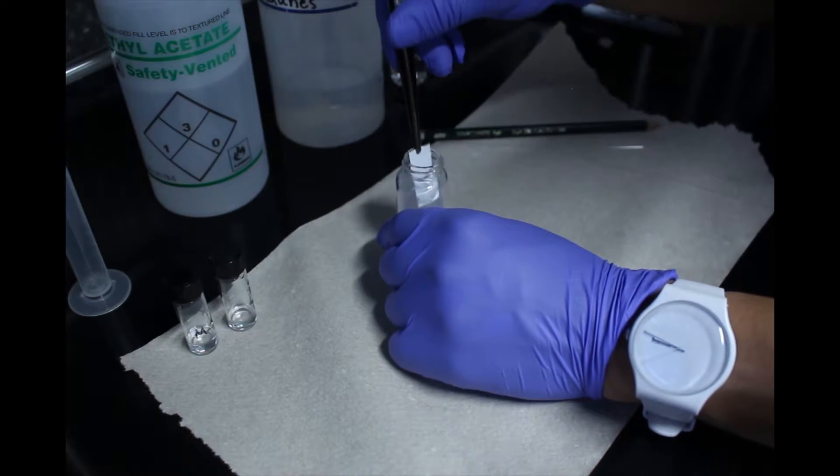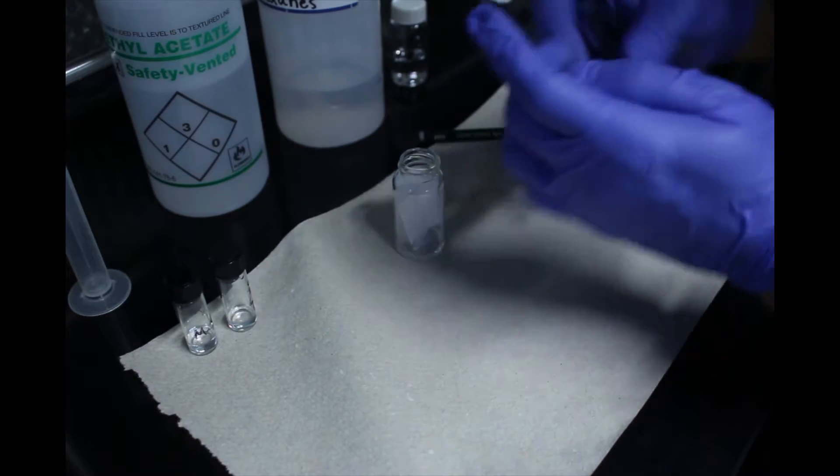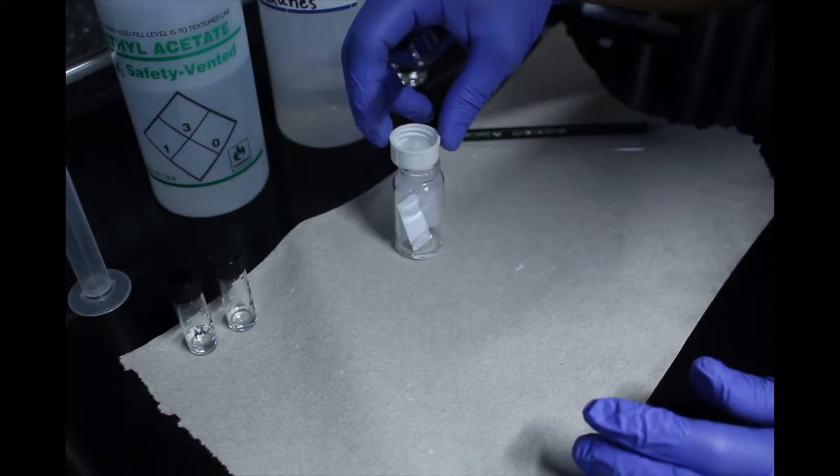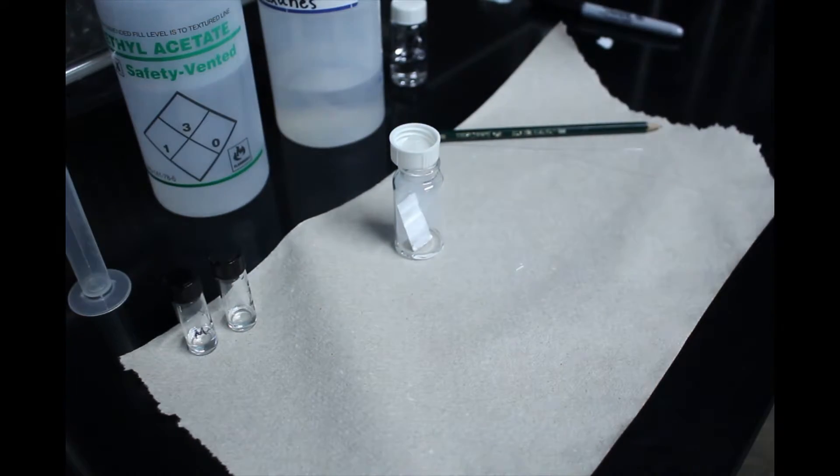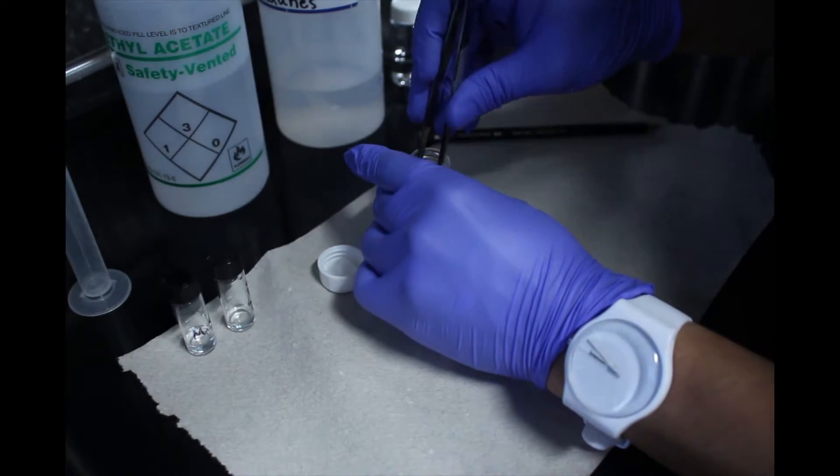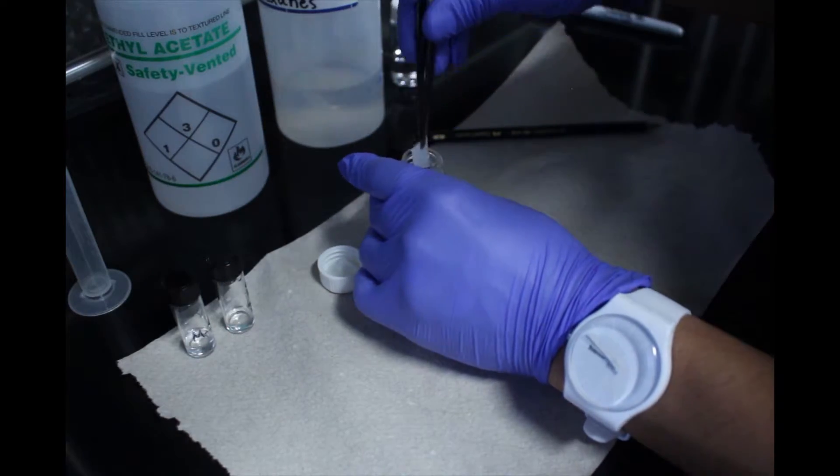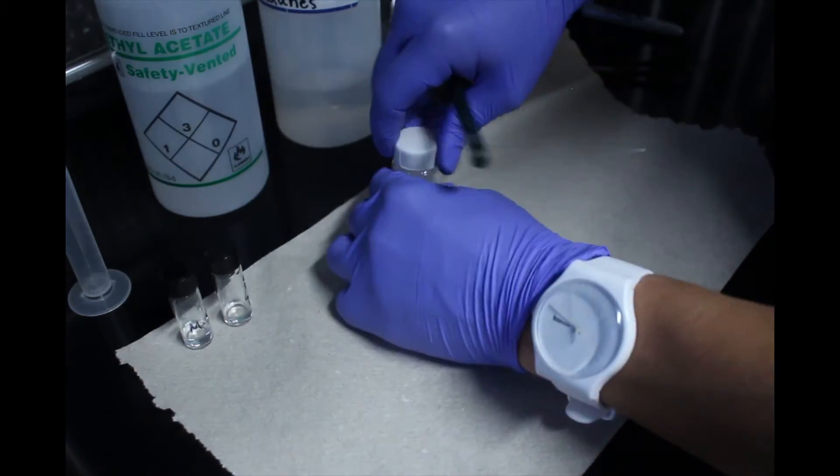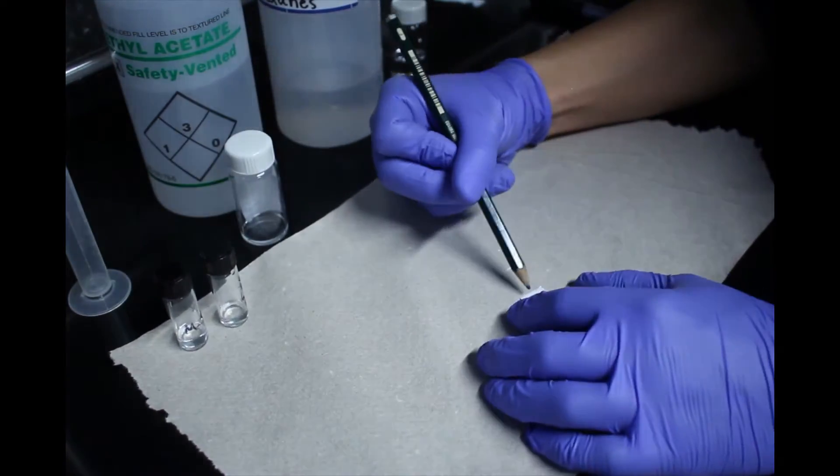Use tweezers to place the spotted TLC plate into the chamber. Place the cap on the chamber and wait until the solvent has traveled up the plate to just near the top. Do not disturb the chamber. Remove the plate and indicate how far the solvent has traveled by drawing a line. This is called the solvent front.